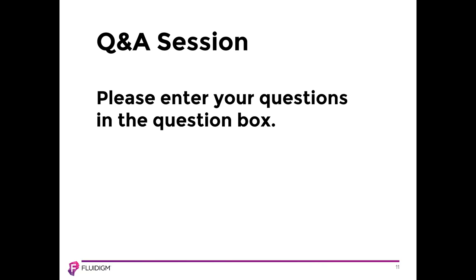We have a question here for Andy for Helios. The question is, my dissociated mouse tumor sample barcoding is yielding only 30% and many events are unassigned. What can I do to prevent this? Excellent question. In order to best help you, I think you need to look at your files and your data, and maybe we can recover some of that.